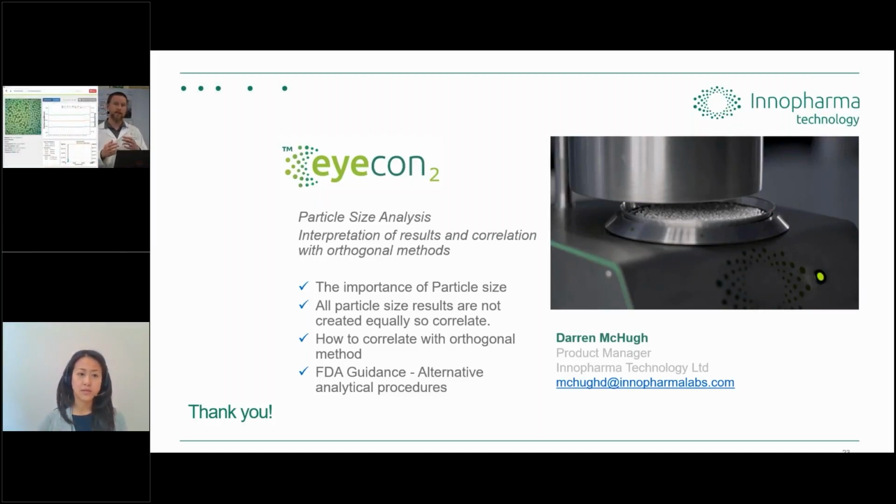If particles are in the background or sitting on top of each other, because of our illumination method, where you can see the red, green, and blue crossover of light hitting each of the particles, we're able to do edge detection of where maybe half a particle is sitting behind a particle and correctly match the two of those.